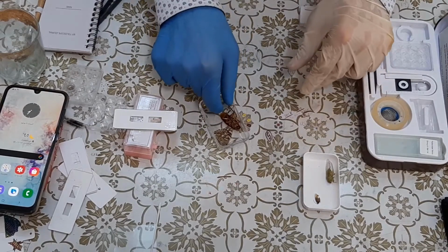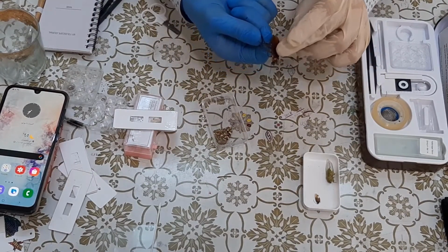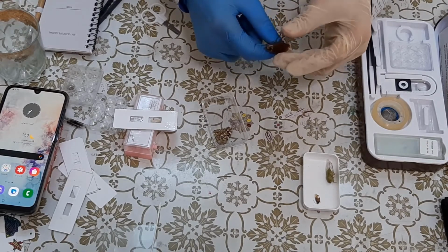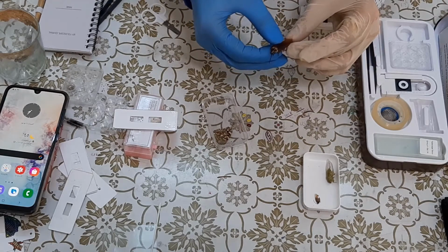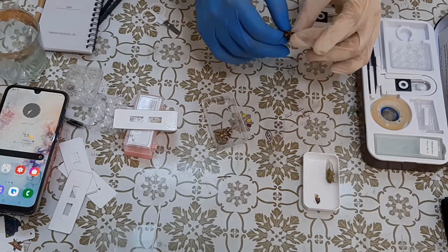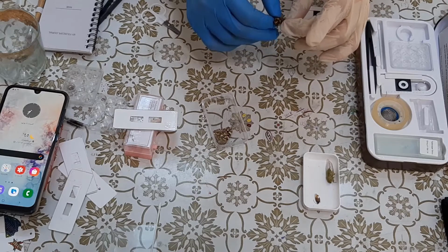Now we finished the first part. I'm going to start with the cricket and take one of its wings. Of course we can look at its legs and head, other stuff, but for today we will be going with only wings to find the mystery, maybe one day.